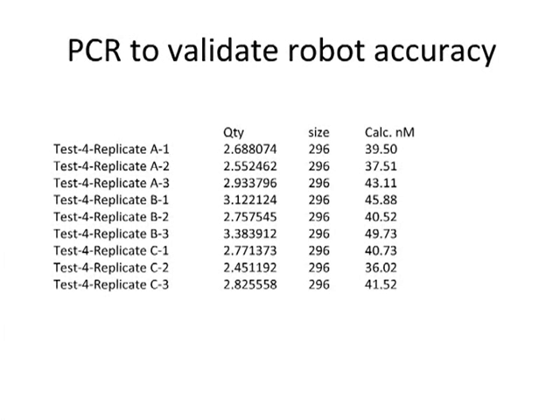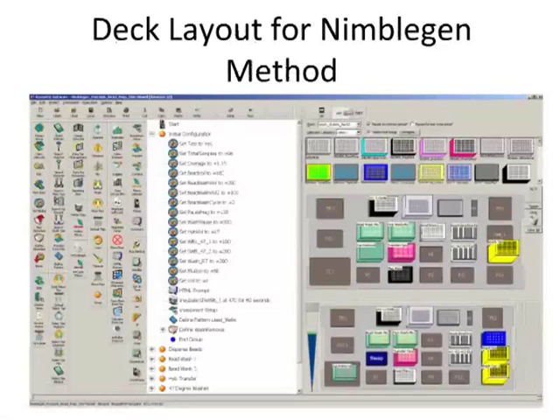But it's just a simple representation to introduce the concept of using real-time PCR as a methodology to validate robot accuracy, or at least the pipetting accuracy on the robot, and even be able to use that as a measure for looking at different robotic decks versus each other, normalizing one robot. Since we run multiple Beckman decks as well as have a Caliper deck, we can use the same assay to look at the pipetting consistency across the different robots.